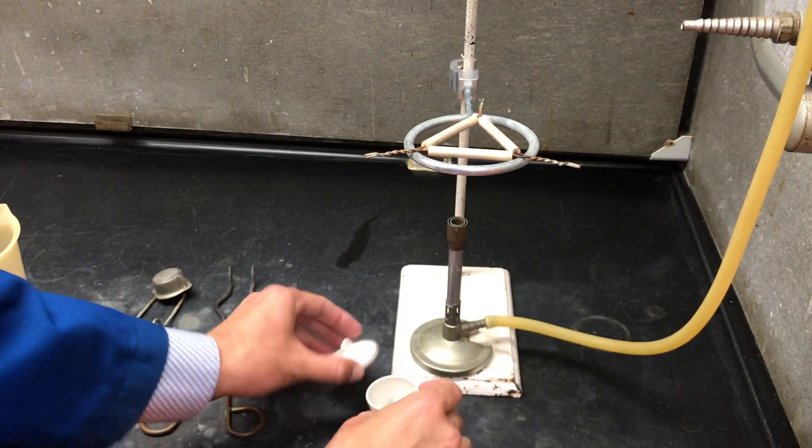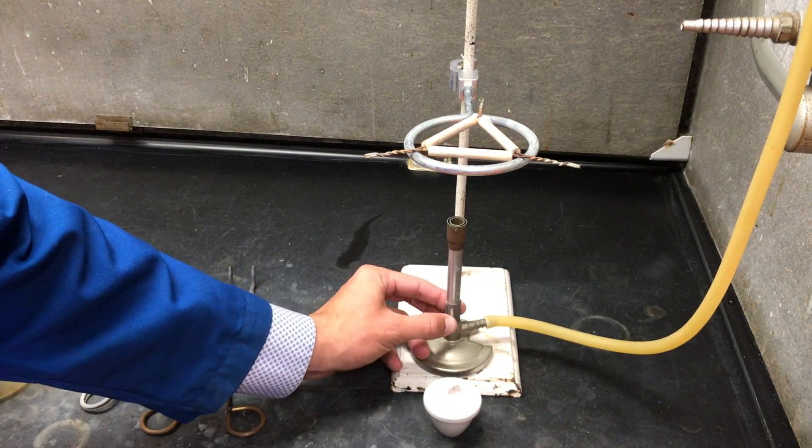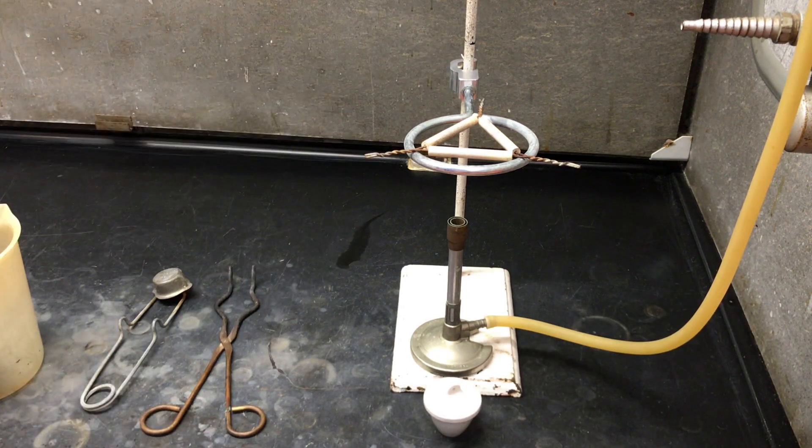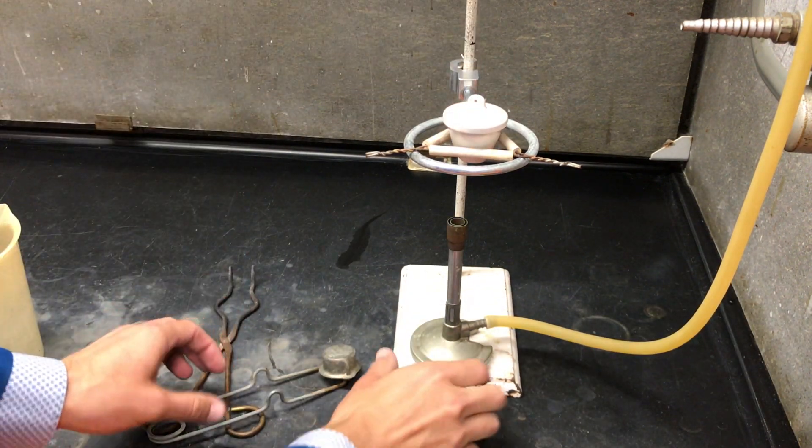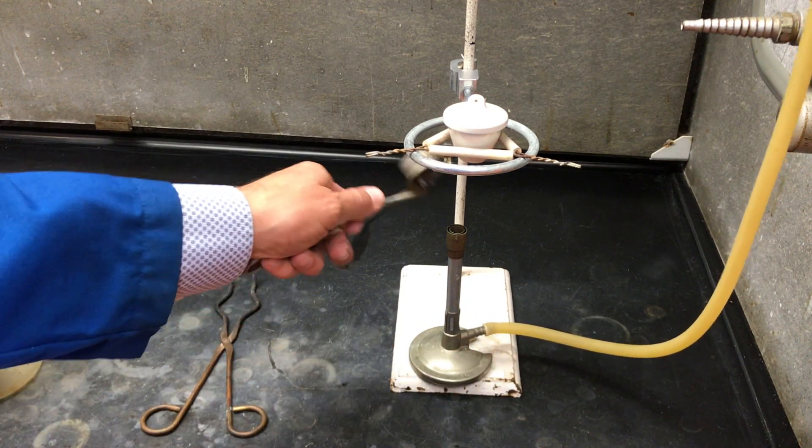Now we'll cover the crucible. Properly light the Bunsen burner as described before and place it on a clay triangle 10 to 15 centimeters from the Bunsen burner and light the Bunsen burner, ensuring that the cone is directly on the crucible.